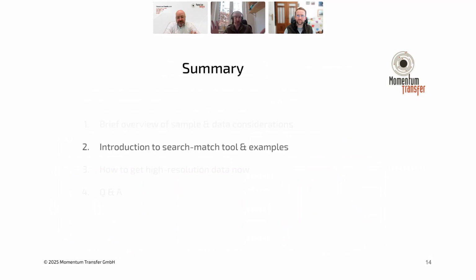Okay, so in the essence of trying to keep this quick, now I would actually go ahead and jump into the tool that we've built. And I would just preface this with, it is a sort of beta version of the tool. We think that it's actually looking quite useful, and we're quite happy with where we're at now. And so we wanted to release it to you guys to play with. Hopefully it can be useful already. And we're also very interested in feedback from the community, as it's something that we're continuing to actively develop now and hopefully bring even more powerful features and more robustness to it.